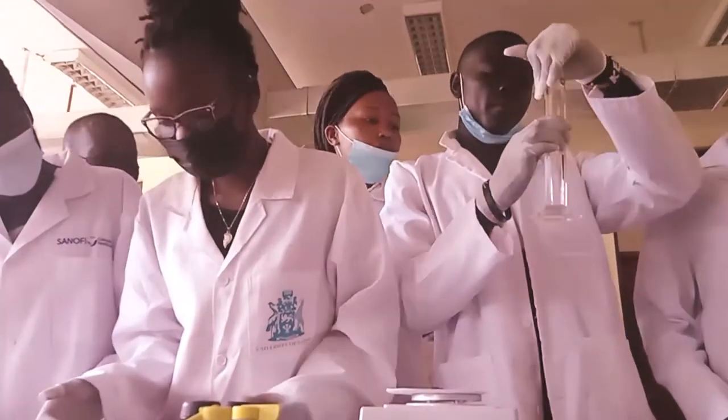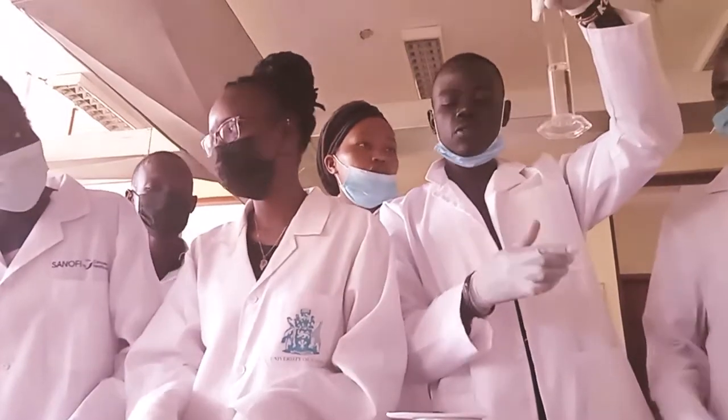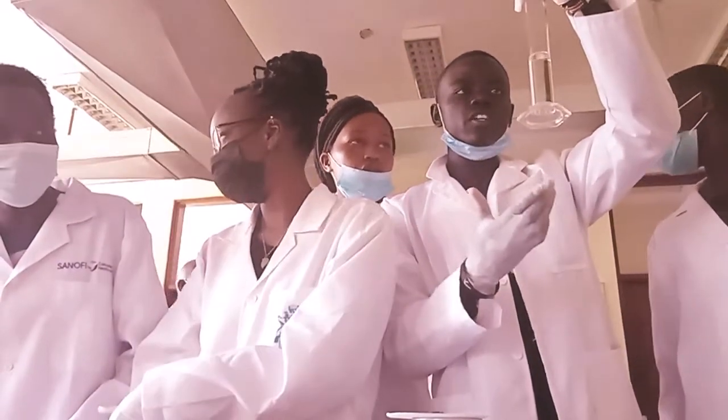We have just measured the liquid which is water. I want this to be distilled water. So we have already done it.